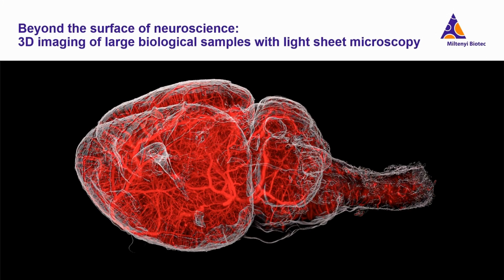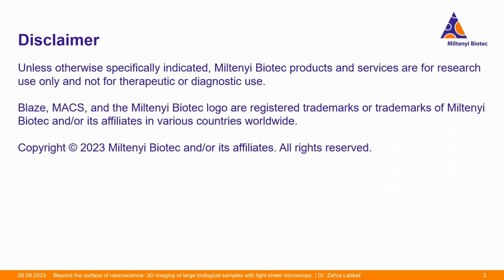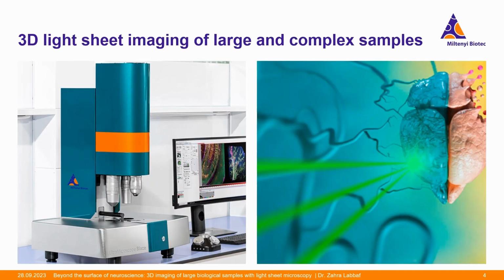Hi everyone and welcome. Today I will talk about 3D imaging of large biological samples using light sheet microscopy. My name is Zahra Labbaf and I'm a product manager for the UltraMicroscope light sheet system at Miltenyi Biotec. In this talk, you will learn about sample preparation and 3D imaging of large and complex samples such as a mouse brain. But before diving into this topic, let's take a step back and see why we even need 3D imaging and what are its advantages compared to 2D imaging.